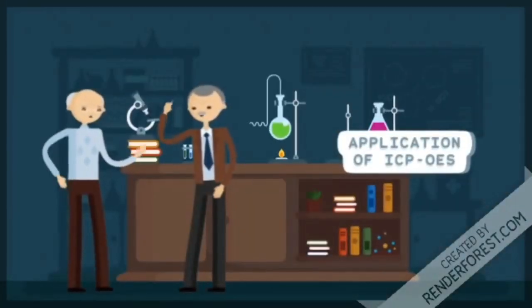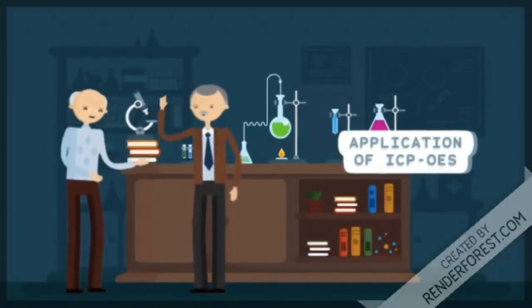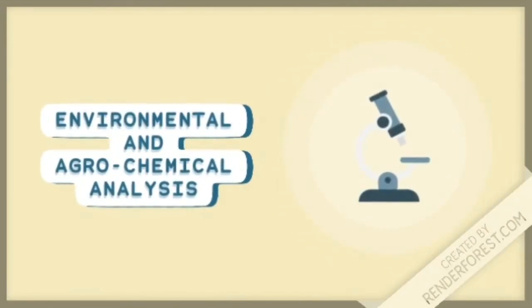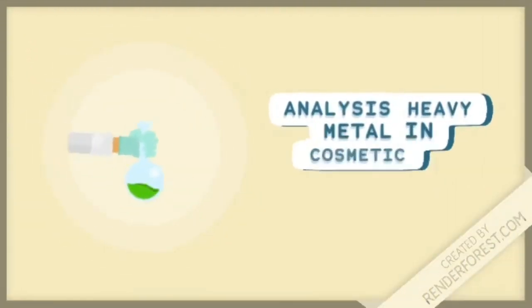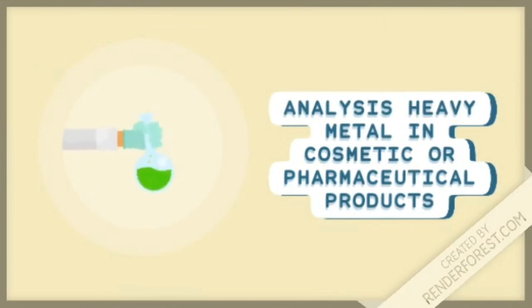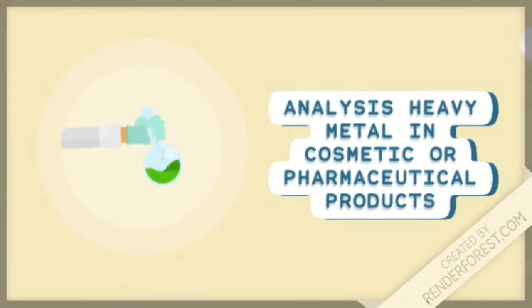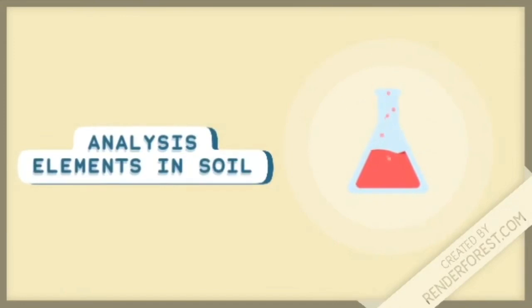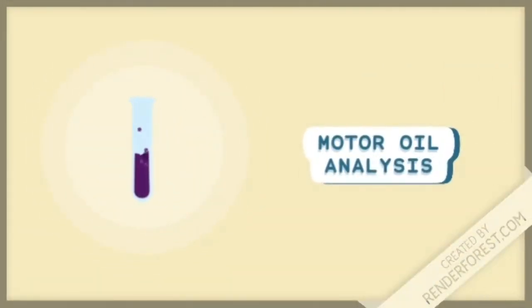Next, the applications of ICP-OES. First, environmental and agrochemical analysis. Secondly, analysis of heavy metals in cosmetic or pharmaceutical products. Third, analysis of elements in soil. And fourth, motor oil analysis.